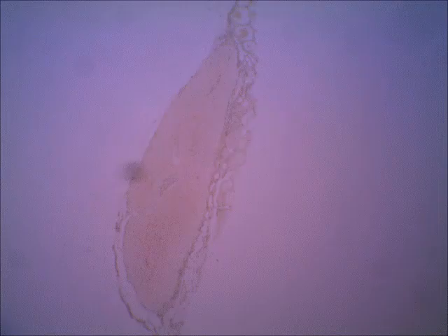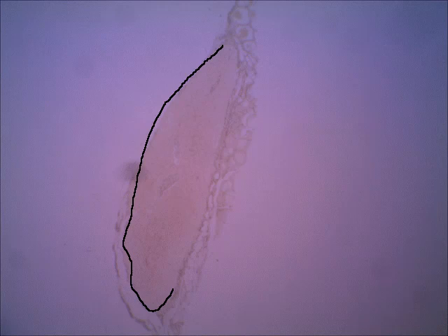I like this slide. This is one we use here on campus. It's very, very faint, and so it's really not a great slide preparation, but I do like it because you can see the parathyroid gland, which I'm going to encircle. There you see it. Sorry. All right, there's your parathyroid gland.